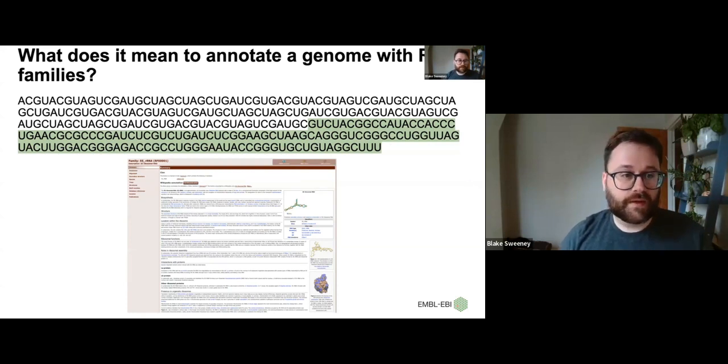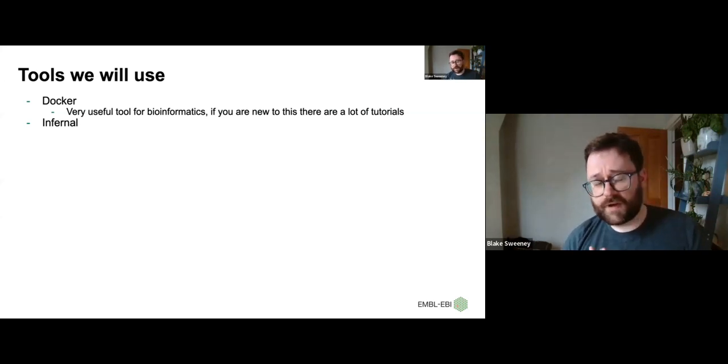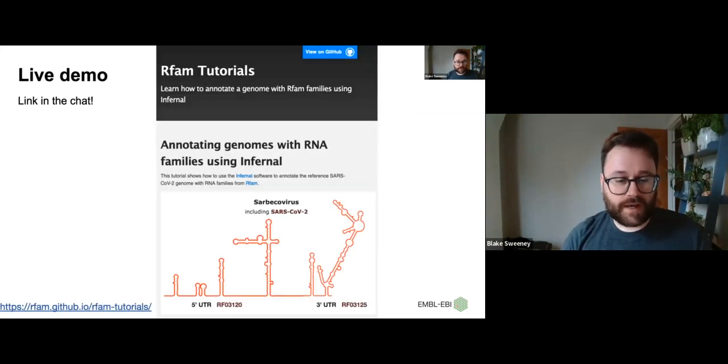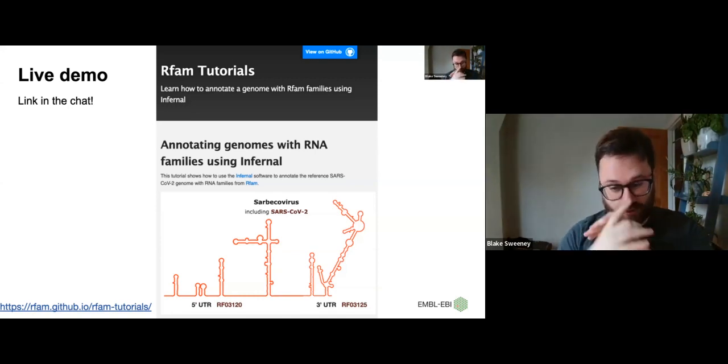And so today we're going to use Docker and Infernal. If you're not familiar with Docker, it's a really excellent tool. I'm not really going to talk much about it, but there's a ton of tutorials out there about Docker. I have a couple of links at the end of things I looked at that seemed helpful. If you're new, I really encourage you to spend a little time to learn about Docker. Maybe someone can drop that link in chat, it would be great. If not, it's in the slides. And this links to our tutorial that we've developed to help do this.